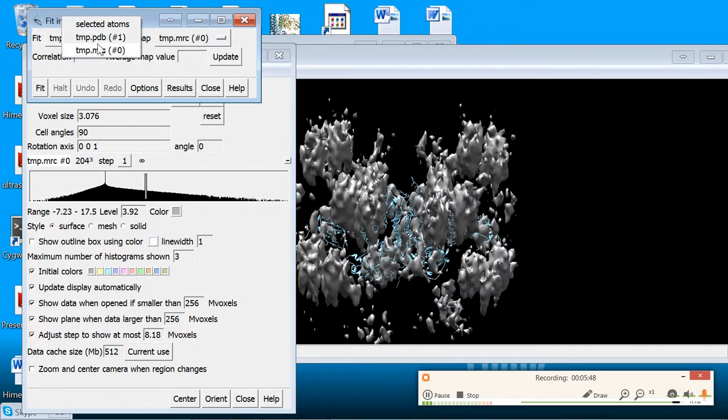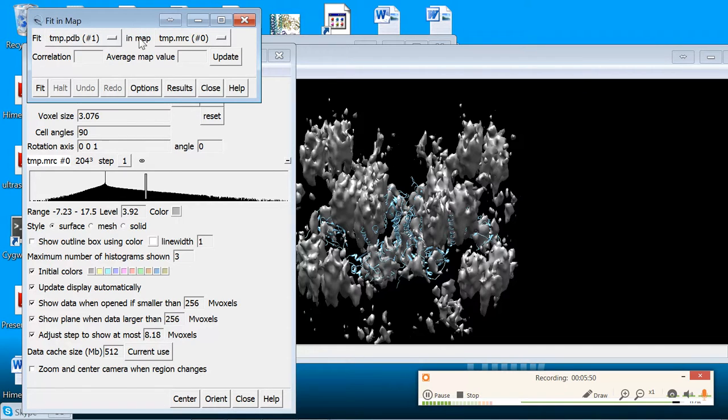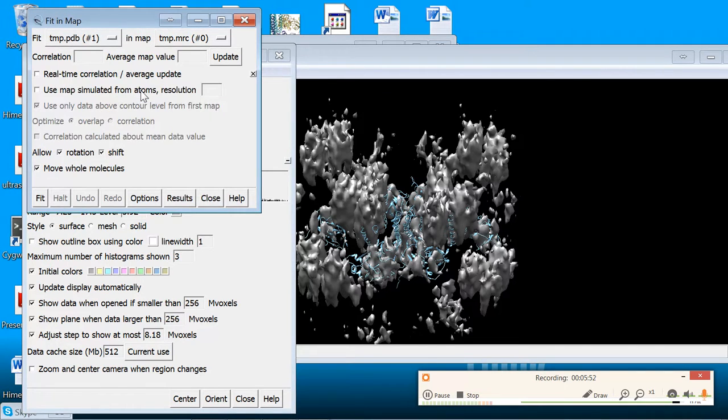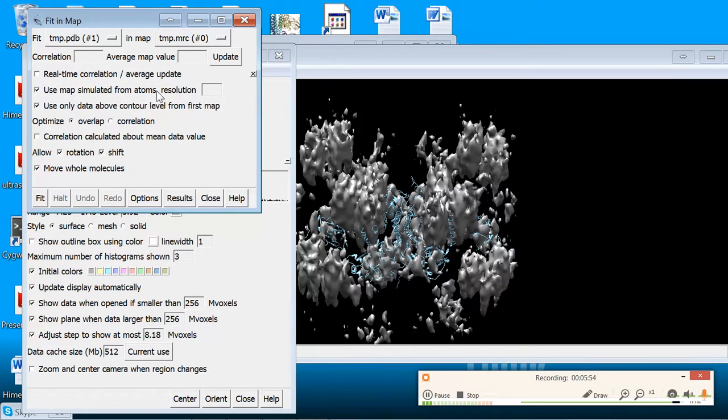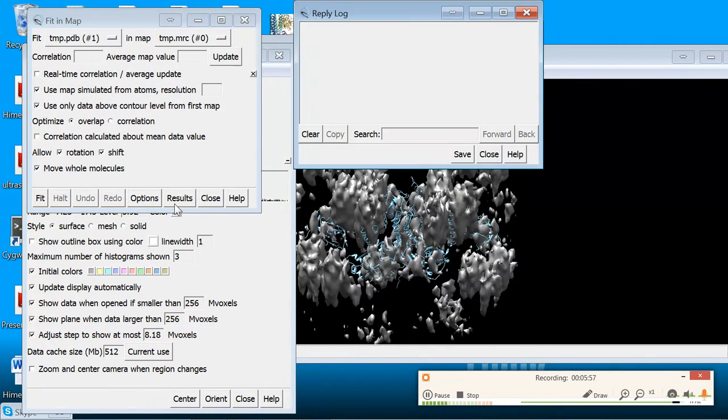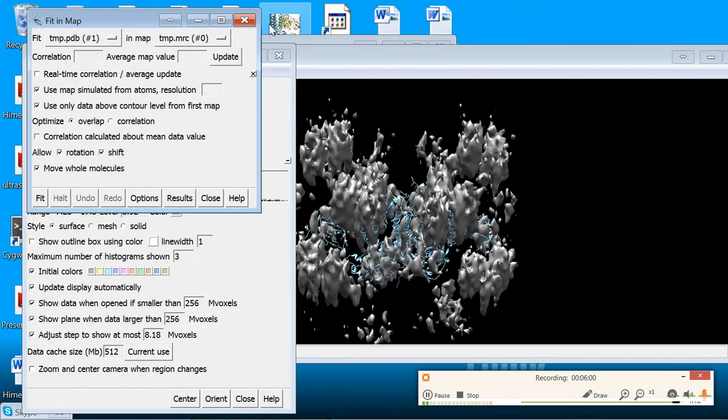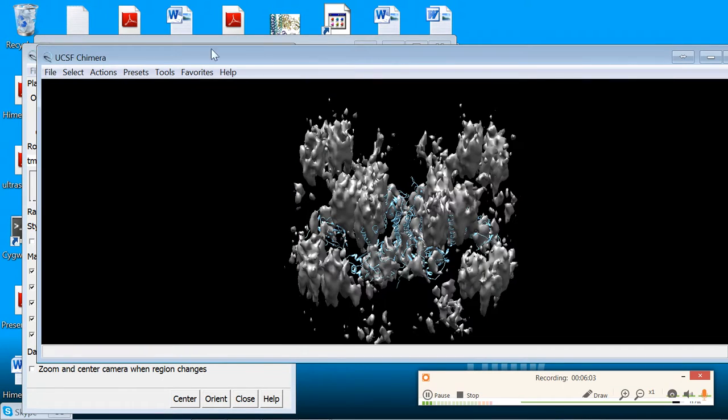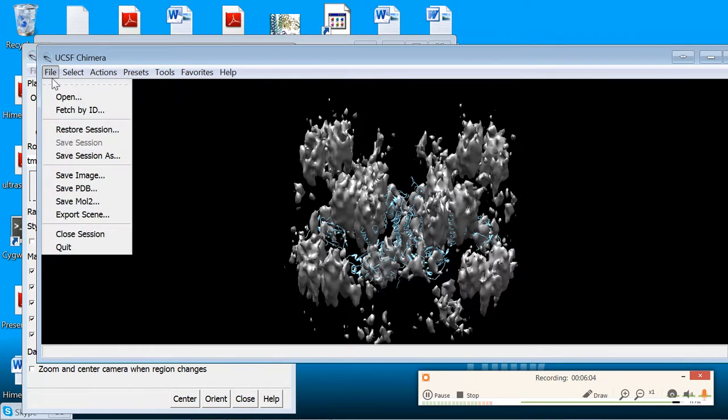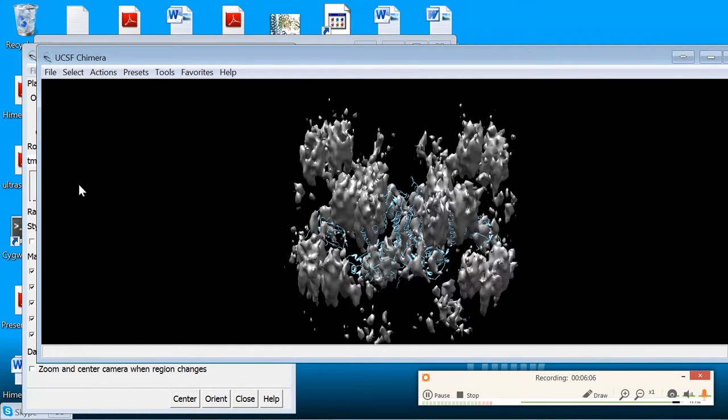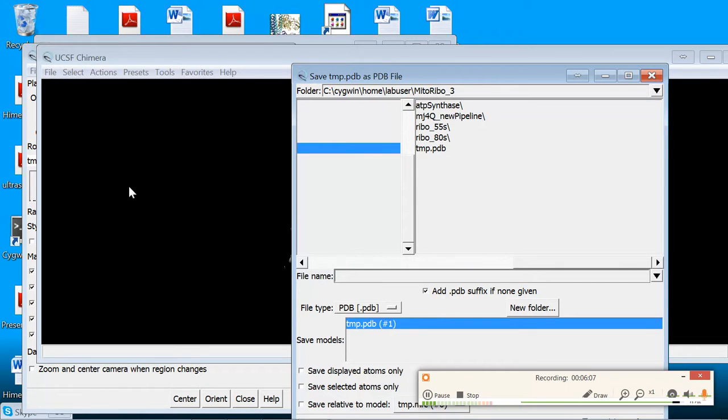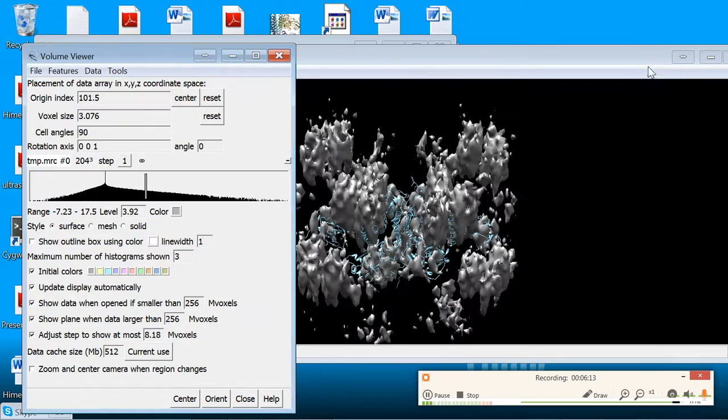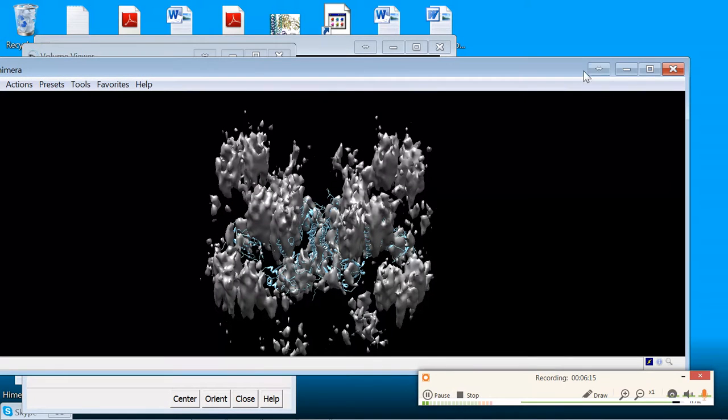You can either fit it directly or you can use the map simulated from atoms at any given resolution. And the results are printed out here in an affine matrix, or you can just directly save the PDB by going to your main dialog window, File, Save PDB. And again, the key thing here was that you have to save it relative to your model. From there, you're good to go and make beautiful, beautiful MDFF. Thanks.